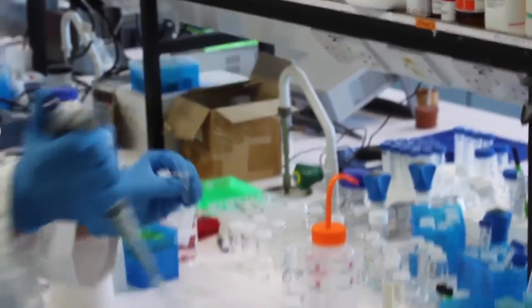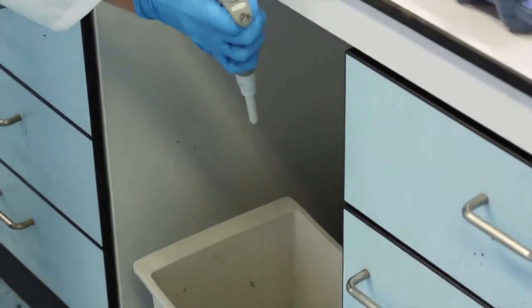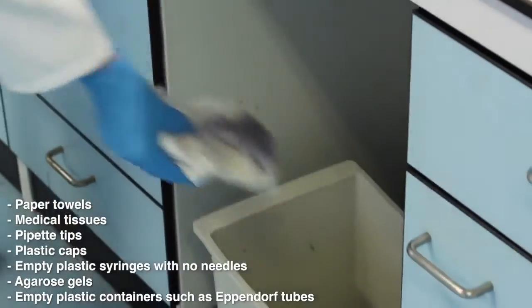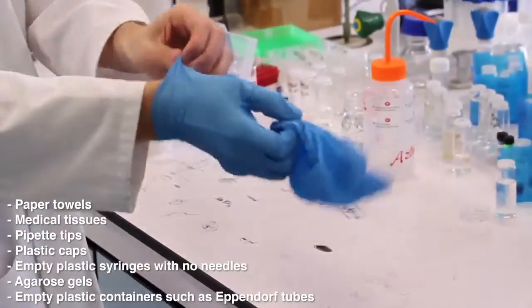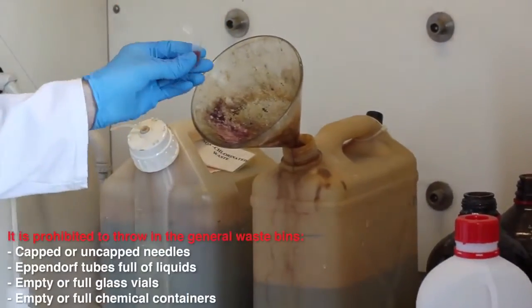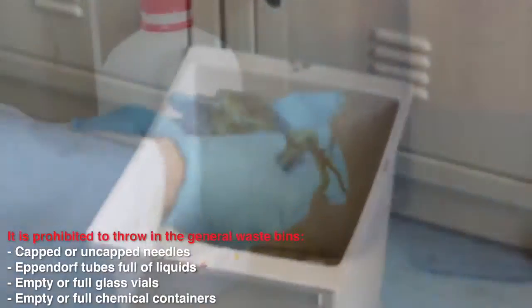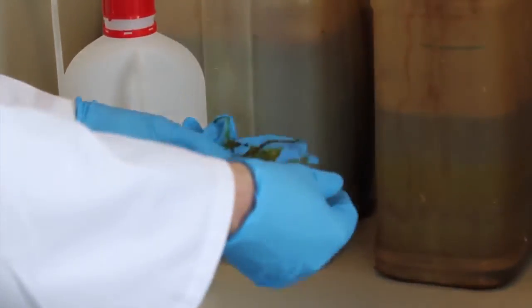The general waste bins can be found all around the lab under each bench, and they will be emptied by the cleaning personnel at least once a week. Here you can dispose of anything that is not heavily contaminated with toxic chemicals, like paper towels, medical tissues, pipette tips, plastic caps, empty plastic syringes without needles, agarose gels, and empty plastic containers such as Eppendorf tubes. Please remember to check that all vials or Eppendorf tubes are empty and that the chemical contamination of the disposed items is minimal. In case you have gloves or other equipment that is severely contaminated, don't throw it in the general waste but in the solid waste bin.